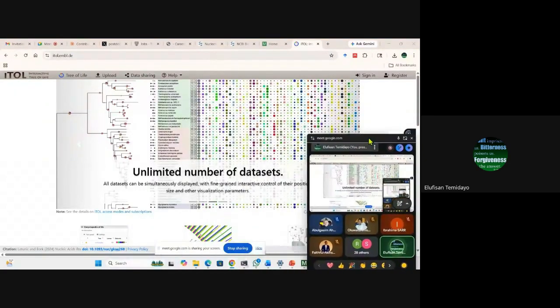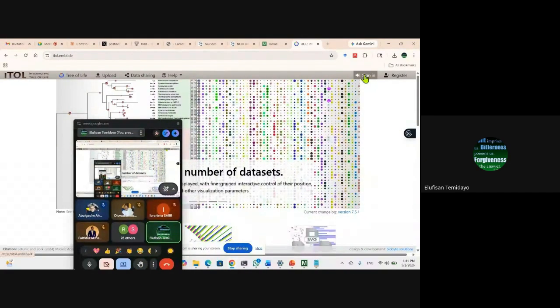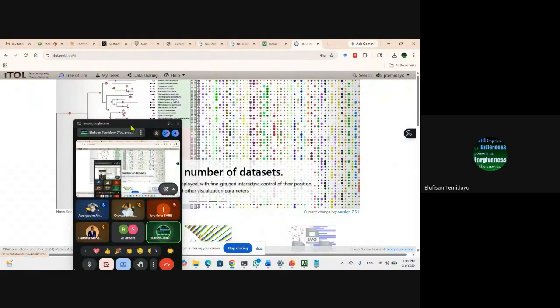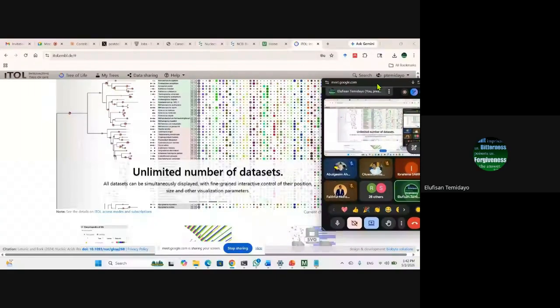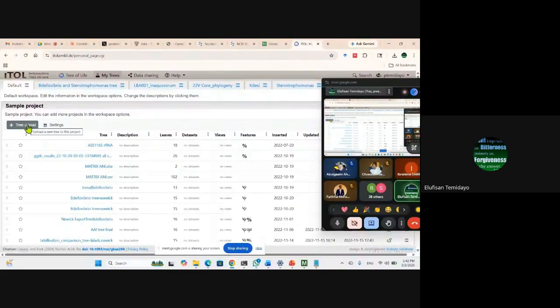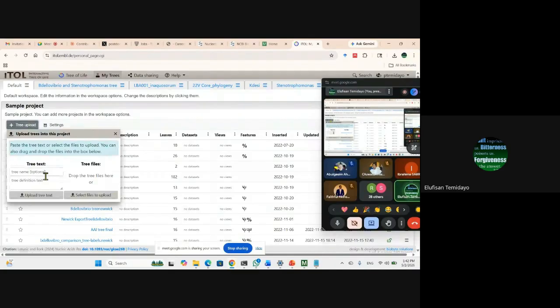First, I'm going to sign in to have the optimal use of it. Okay, now I've signed in. I hope you are seeing my screen. Are you seeing my screen? Let me know. Okay, yes, thank you. Now the next thing is I'm going to look at where it says my tree. I'm going to upload my tree. Remember, we already saved our tree with a name, in a Newick format. So let me go to tree upload.